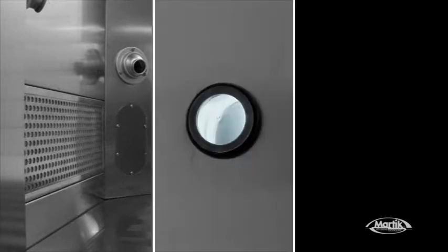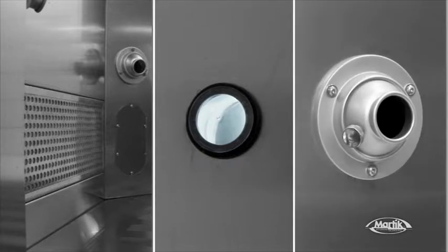First, the air is sucked in by tubes provided with HEPA filters. The UV-C lamps sterilize the air that is given off downwards and sideways into the unit by means of nozzles. This way, all polluting agents are shaken off the worker's skin and clothes.